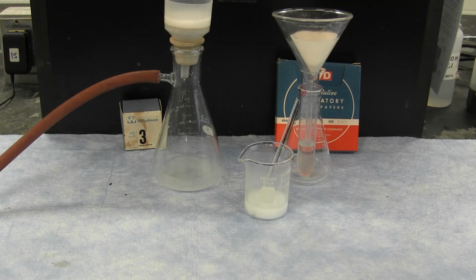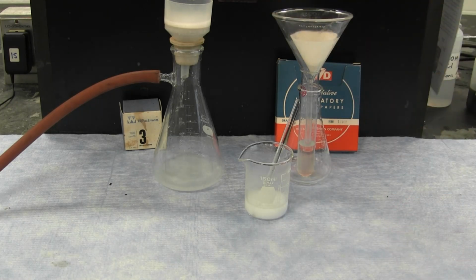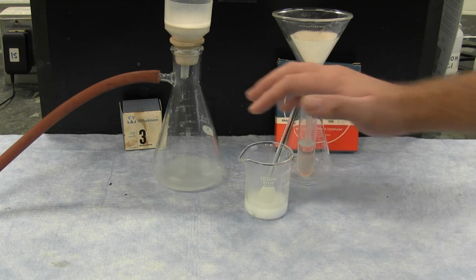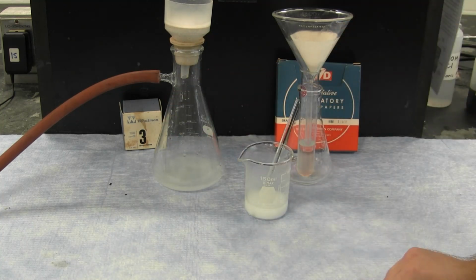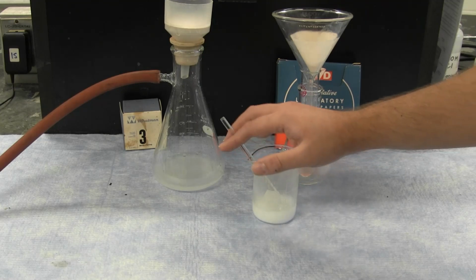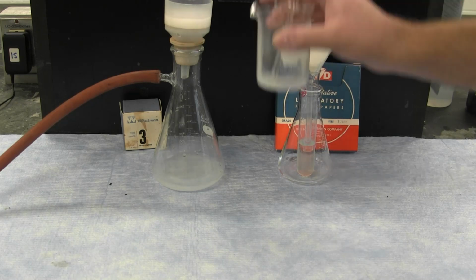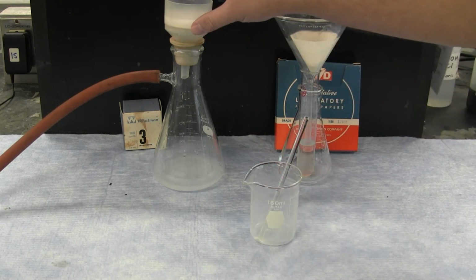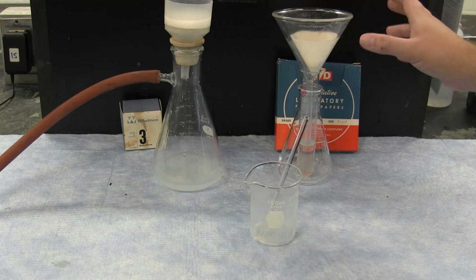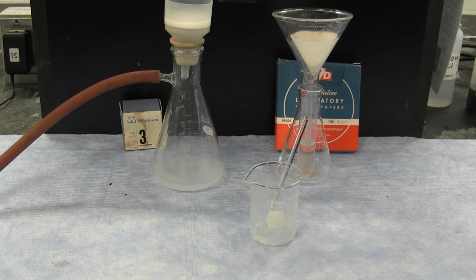However, the special use of the Buchner funnel and the capability of pulling a vacuum on a glass container such as this is required. In many types of lab settings, a vacuum filtration would be used to more accurately collect the solid, where the gravity filtration will be used more so to look at the filtrate or the liquid passing below.